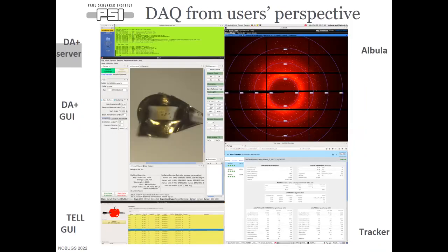If you're a user collecting at one of our beamlines, this would be the view you'd have of our console. You'd have your data acquisition server in the top left, your data acquisition GUI in the middle left, your robot sample changer TEL GUI in the bottom left. In the top right you'd have the diffraction viewer — we use Albula for viewing live streams and reviewing grid scan data. In the bottom right we have our tracker, which gives us live updates with server-sent events from our processing tracker and database.